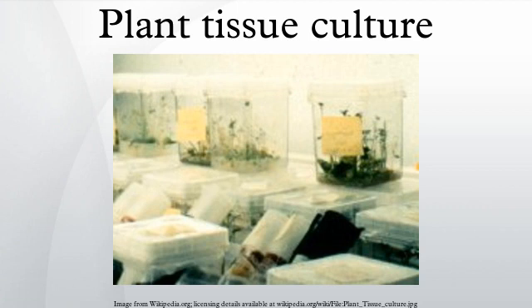The first method, involving the meristems and induction of multiple shoots, is the preferred method for the micropropagation industry, since the risks of somaclonal variation are minimal when compared to the other 2 methods. Somatic embryogenesis is a method that has the potential to be several times higher in multiplication rates and is amenable to handling in liquid culture systems like bioreactors.